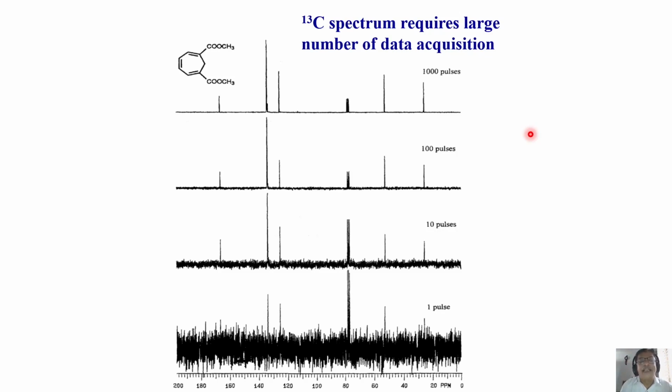compared to proton. I give you a simple example. Of course, nowadays things have become better with the high frequency spectrometers and electronics is different. There is a change in electronics. The NMR methodologists doing the experiments have improved so much. So many sophisticated experiments we can do. We can do faster, no problem. But still, if I take proton spectrum in 1 minute, carbon-13 will take at least 15 minutes to 30 minutes, depending upon the concentration and the number of carbons you have in the molecule. So yes, basically, relative to proton, carbon is time consuming.